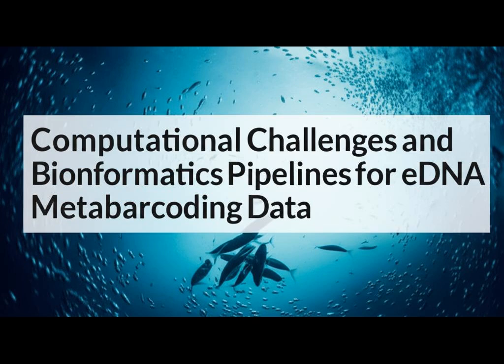eDNA metabarcoding is a powerful tool, letting us see which species are present without needing to catch or see them directly. It works by sequencing short DNA barcodes from environmental samples. But getting from millions of sequence reads to a list of species requires a complex process known as a bioinformatics pipeline. Think of this pipeline as a digital assembly line for genetic data.